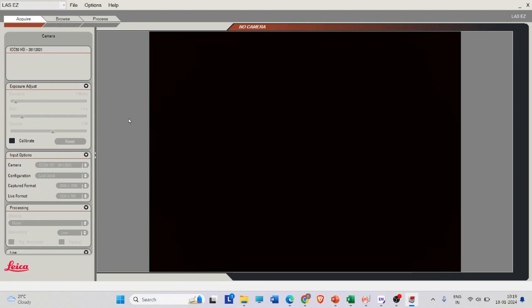These are the few basics that we also covered in the PPT, right? Now coming to the bright field and polarized light microscopy. In polarized light microscopy, we use polarizer filters. If you recollect, in the presentation we have shown you two polarizing filters that are used to make a bright field image into a polarized image.